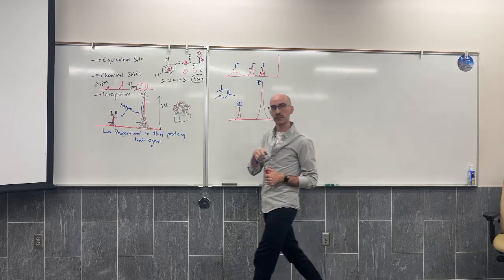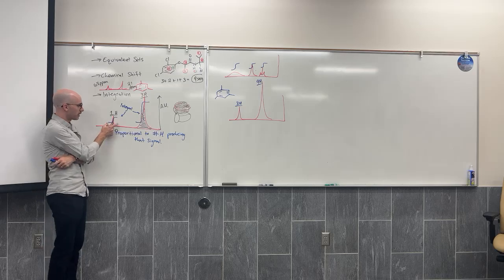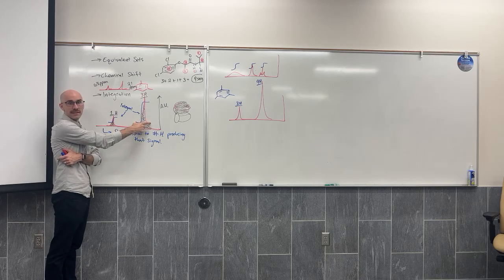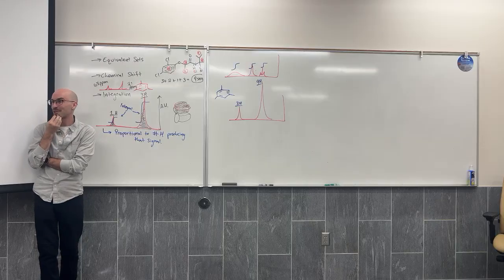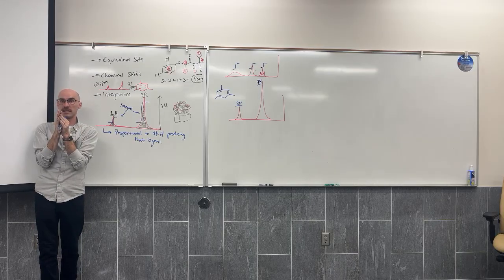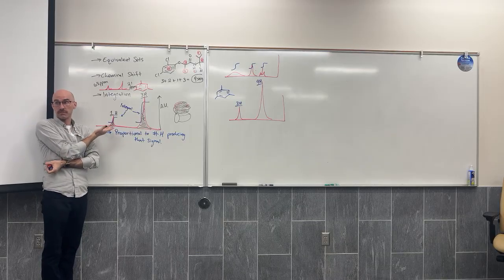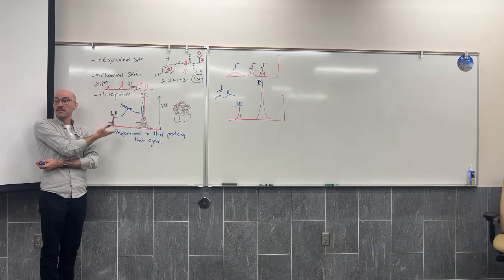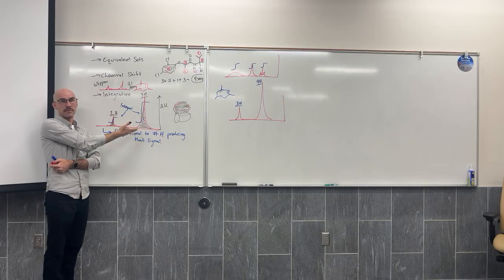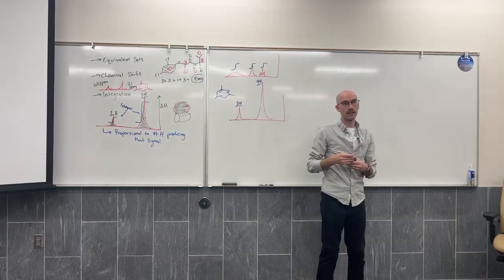Because what the instrument is doing, and you guys are going to get to experience this in lab next week, is it's saying this has some integration smaller than this, and I don't know what numbers I should be using, so I'm just going to take my numbers and normalize it to say this is 1, this is my smallest integration. And relative to that, this had an integration 3 times larger. But actually the best way to represent that for our molecule is to say 3 to 9.